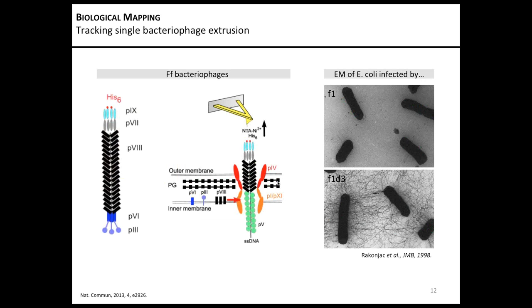So in the next study, we start to use this technology to solve more complex biological questions. And for the small story, I already tried to study this kind of experiment at the beginning of my PhD with the conventional force volume, but I was not able to have any results because we have only a few adhesions in very localized places on the bacteria. So you will see this kind of measurement was not possible before.